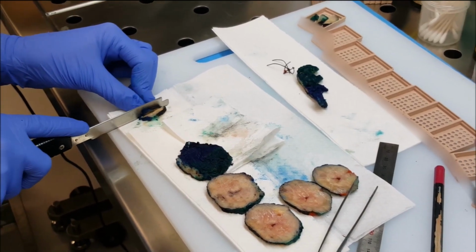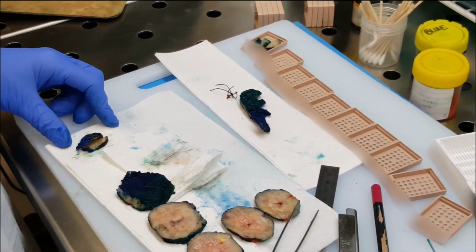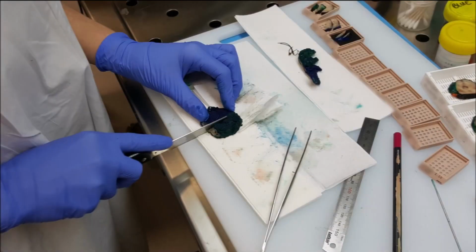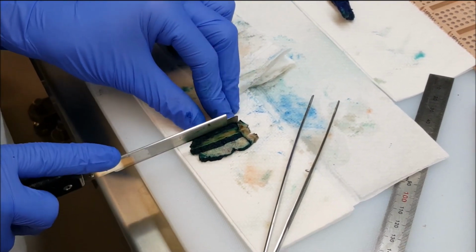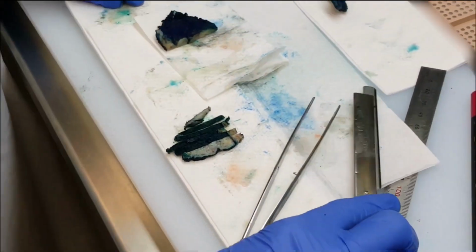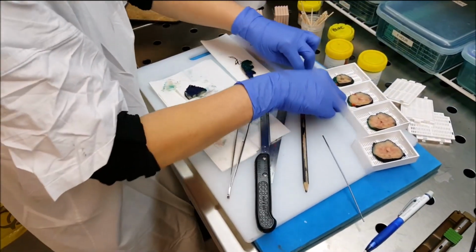The apex of the prostate is then sectioned sagittally and placed in a separate embedding cassette. The apex specimen is sectioned orthogonally in a sagittal plane compared to the axial plane used for the body of the prostate. This is repeated for the base of the prostate, and the sections are subsequently transferred to separate embedding cassettes. The prostate specimen has been systematically sectioned and is now ready for embedding in paraffin.